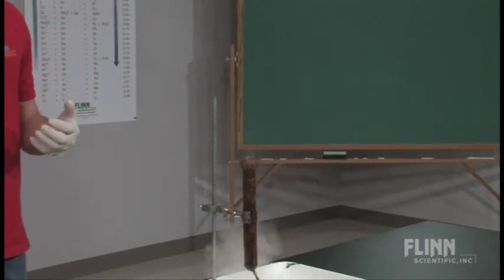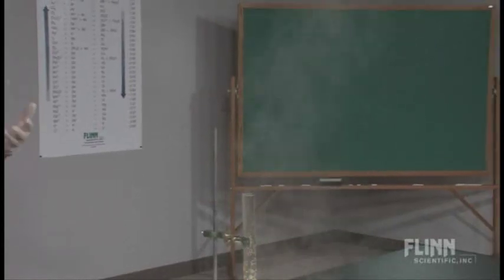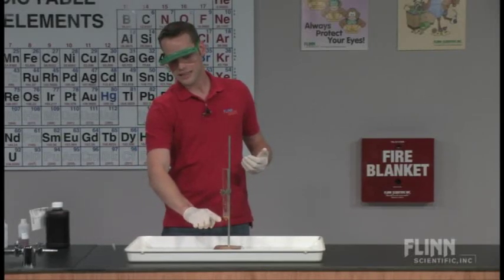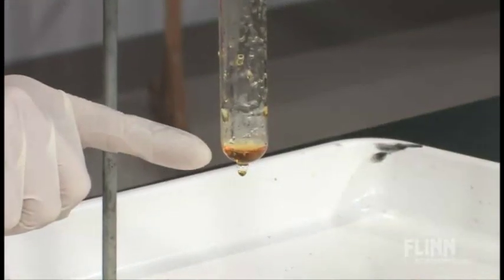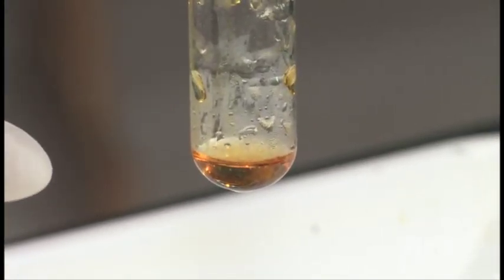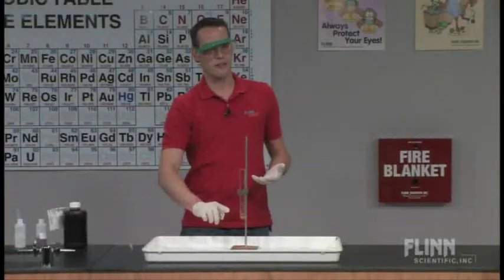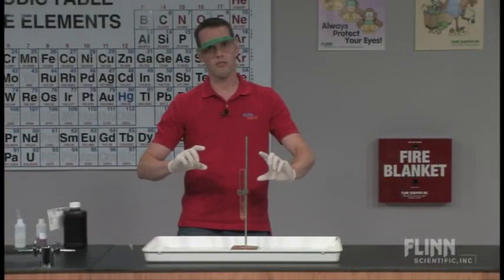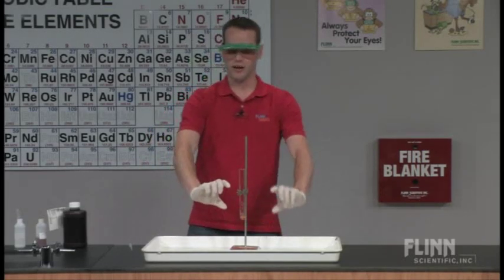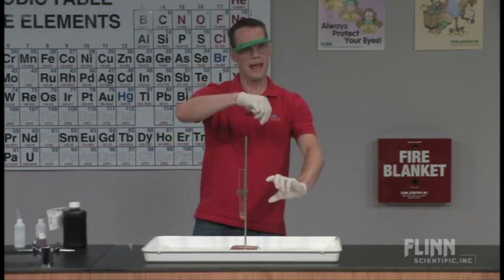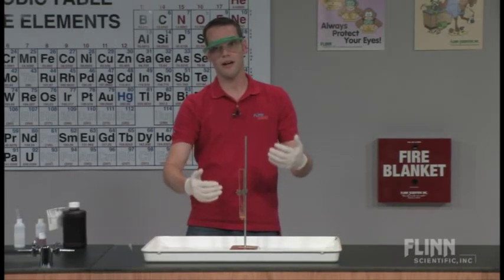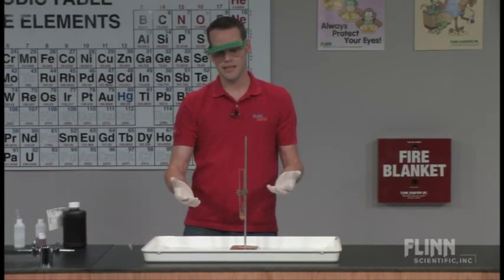Eventually you get a pretty violent reaction really quickly and a really dramatic cloud. The interesting thing is that if you look in the chemical splash tray, there's still that yellow color from the iron chloride solution. My students usually remark that it's a little bit lighter than before, so sometimes I'll take an equal volume of water, dilute it, and add the same amount of iron chloride to show that it's really just a dilution — it's not actually being chemically changed to a new substance at the end.